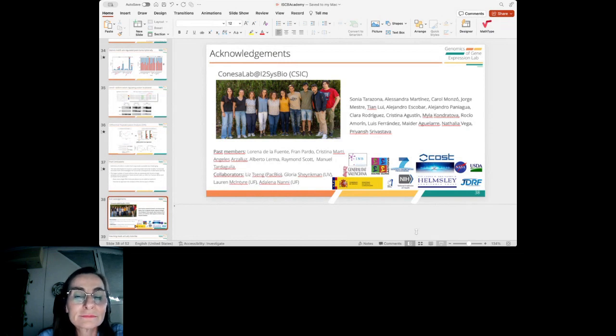Gotcha. Okay, that makes sense. Our next question: is there any explanation for ONT shorter reads compared to PacBio in cDNA experiments?